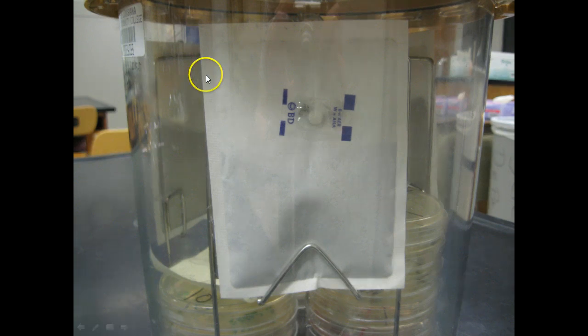Can I interject? Yeah? To help you remember this, do you recall using methylene blue before in the class? Yeah, it's one of the simple stains that we use. So it's blue when we do our staining procedure with the air in the lab. We also put it in the plate that we used last week for counting colonies, that was eosin methylene blue. Mm-hmm. So again, it's blue in the air. Yeah.